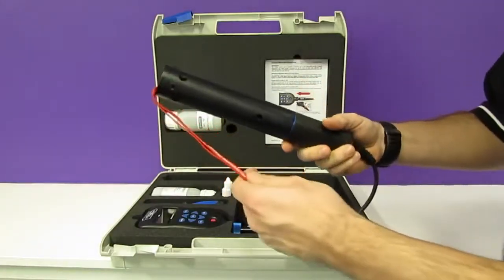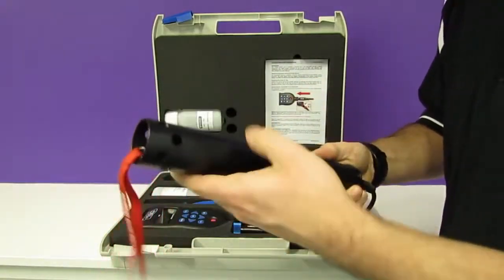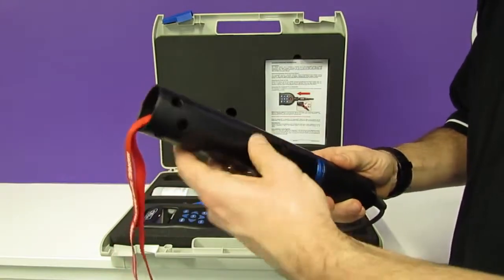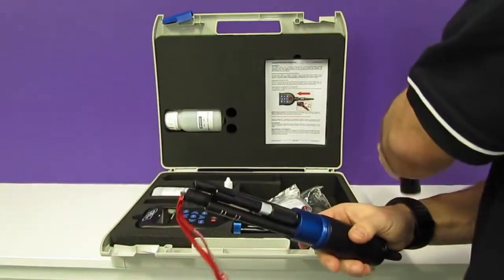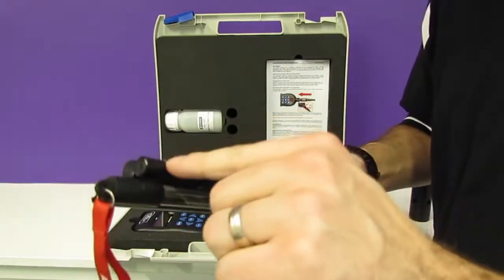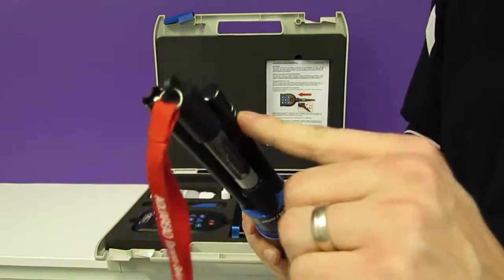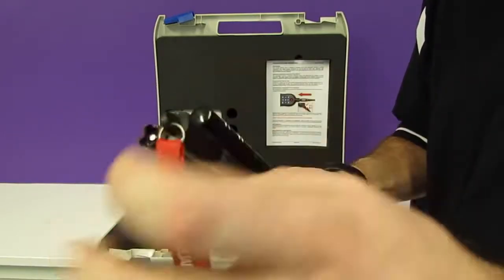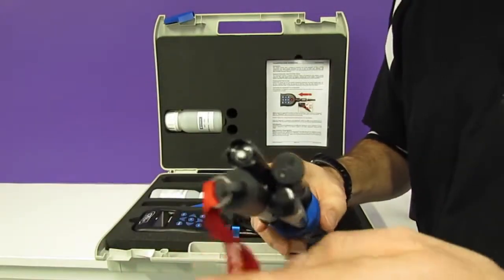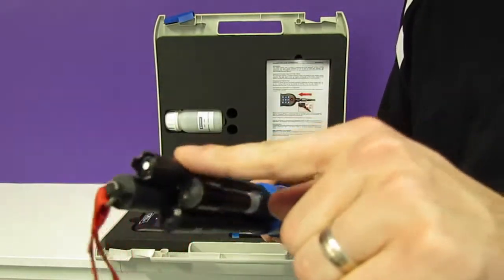So this is the AP800 aquaprobe. Let's take the sleeve off and have a look at the differences between this and the 2000. So it's very similar on the inside. We still have our 4-ring conductivity. You'll notice there's no dissolved oxygen on the end. We have our pH/ORP sensor, and then here we have our galvanic dissolved oxygen sensor.